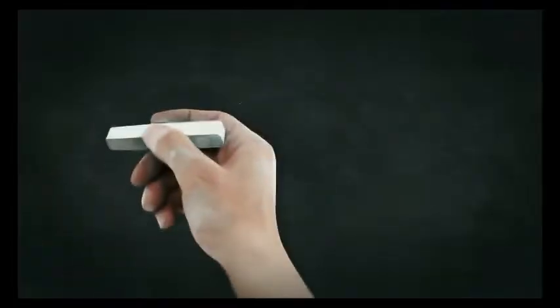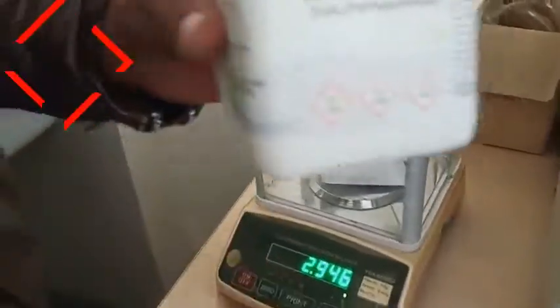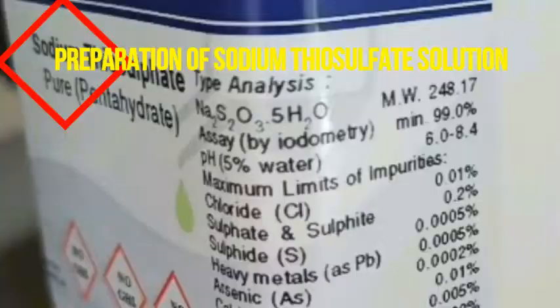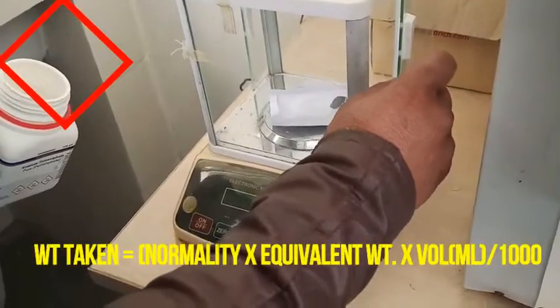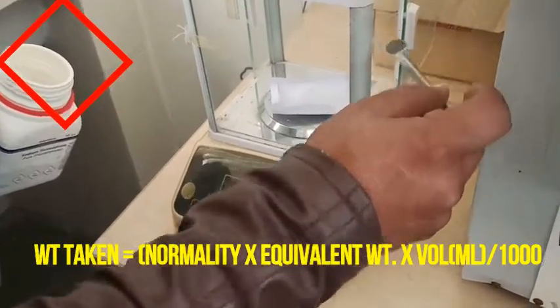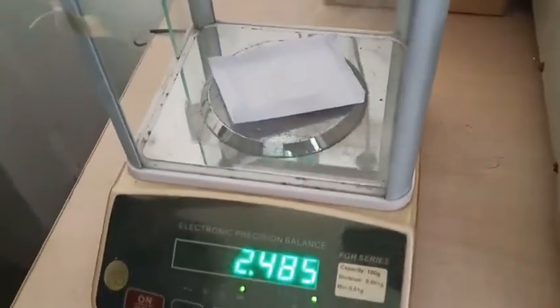Hi everyone, welcome back to Spectrum Classes. Today in this video we are going to prepare sodium thiosulphate solution as well as its standardization with the help of potassium dichromate.